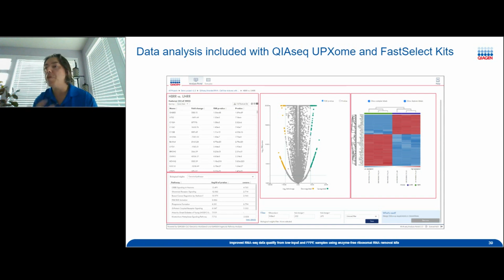We can also get upstream regulators, such as transcription factors that may be driving the changes. We also blast against microRNAs that can be regulating that gene expression, and then also provide back any other biological data that we have. For human, mouse, and rat, we have a lot of data on microRNAs and gene expression components that we can put in there. And as we bring more and more species up, we can add that data back.